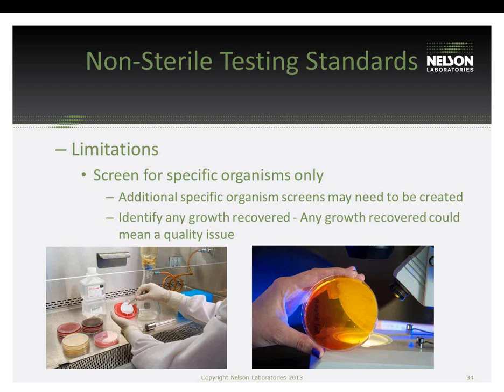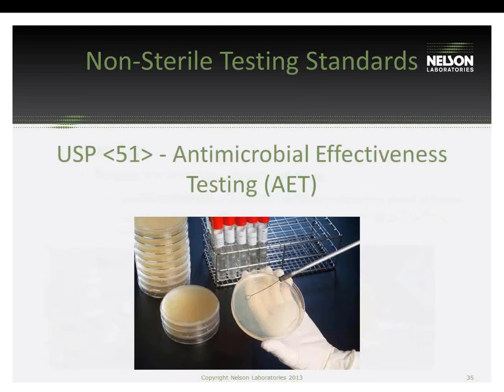But if this acceptance criteria is set to have an organism that's not outlined in the USP, a separate screen needs to be created.